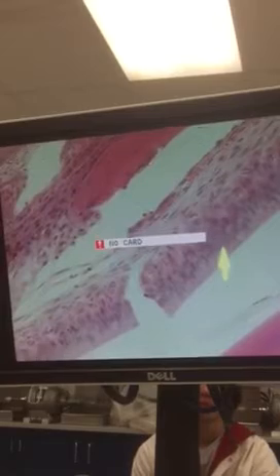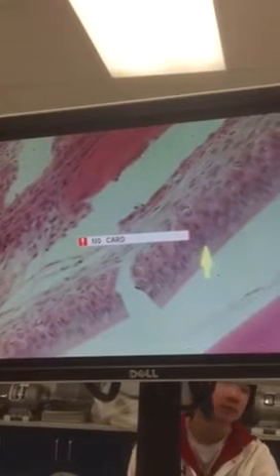So these ameloblasts will have about the same morphology, proximally located nucleus. As we keep going down this line, we begin to see those ameloblasts starting to change a little bit. Now this is going towards the oral cavity. And right along in here, they're beginning to get shorter. Nuclei is taking a more central position. And so right in here, these ameloblasts are going into the protective stage.